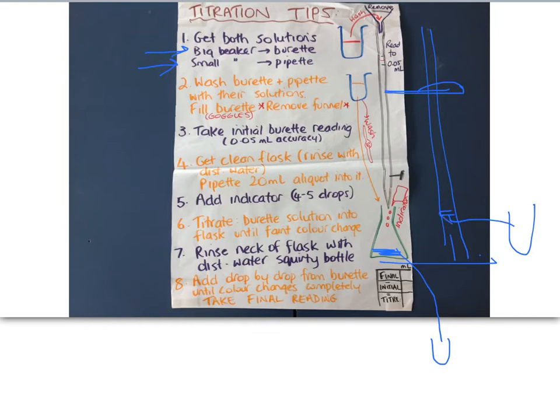You're going to wash the burette and the pipette with their solutions. So this is the one that you're going to be measuring 20 ml of. So this pipette needs to be pre-rinsed with that solution.